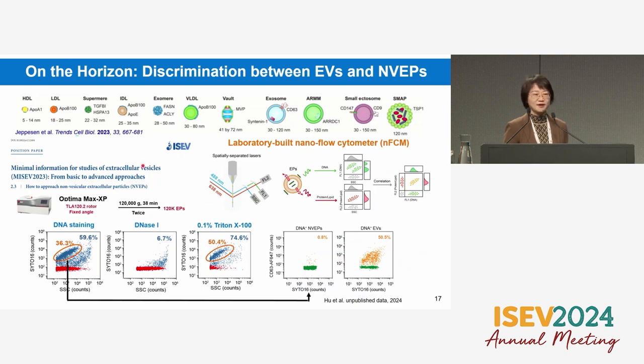So with the awareness of the abundant presence of NVEPs, we have done some study for preparations that are less pure. This is a laboratory-built nanoflow cytometer with two spatially separated lasers.